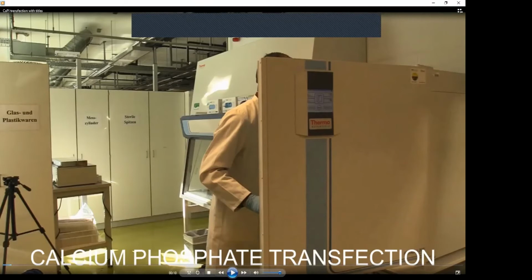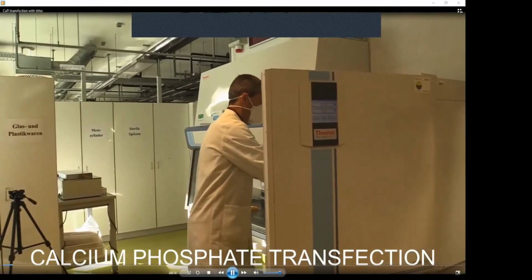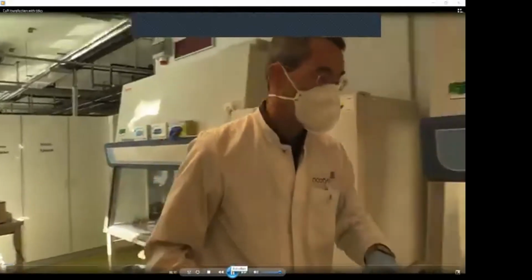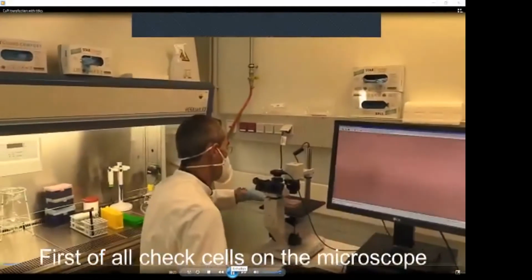And they were incubated overnight at 37 degrees. The next day, the first step which you have to do for this transfection is that you remove cells from the incubator and you check whether everything is all right with them. That means if they are not contaminated, and mainly what is the cell density. So the first thing is the microscopy.